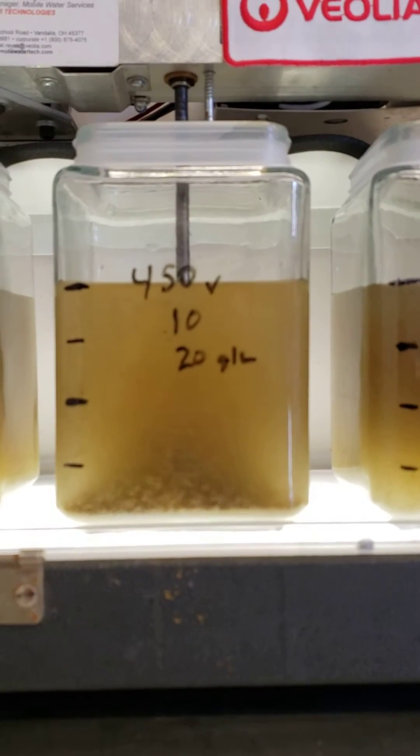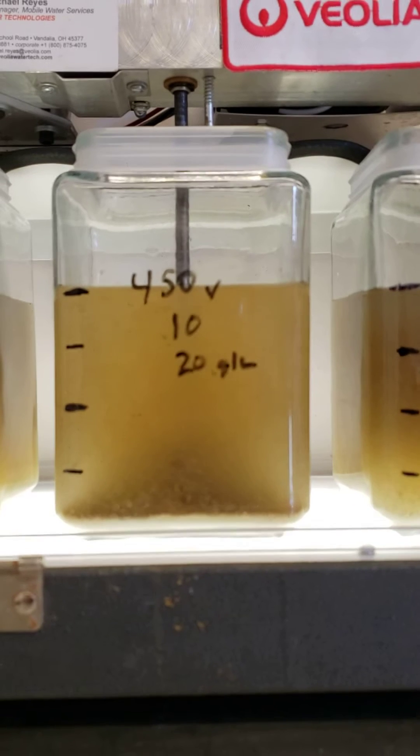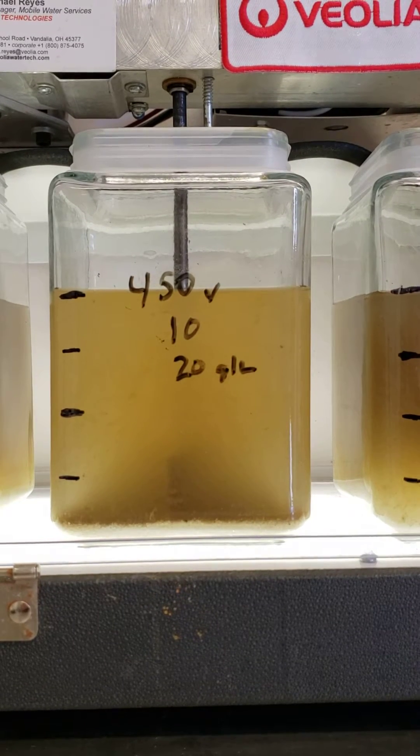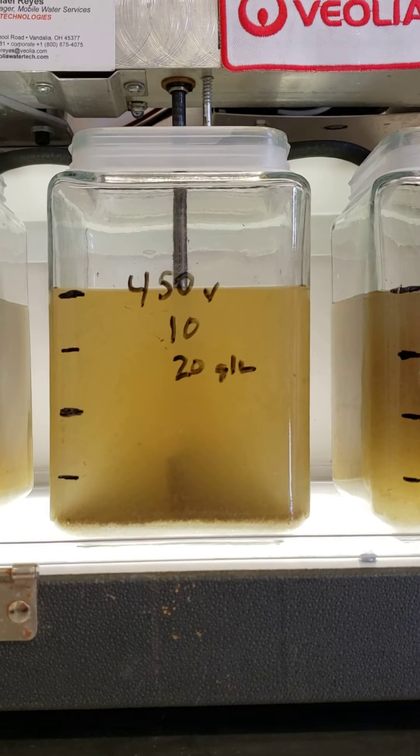All right, the sample's got 450 parts by volume of coagulant, 10 parts of flock, and then 20 grams per liter of sand.